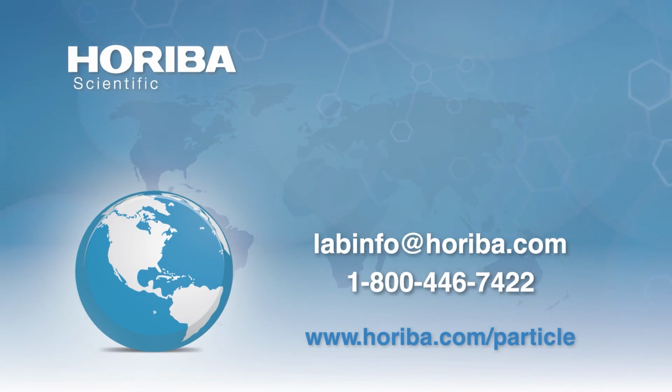Yeah, I'll do the second one first because the simple answer is no, we do not have any automation for this, simply because there is so much involved with getting the sample cell set up and getting it put into the centrifugal disc itself. It's just very, very difficult to do that in an automated fashion.